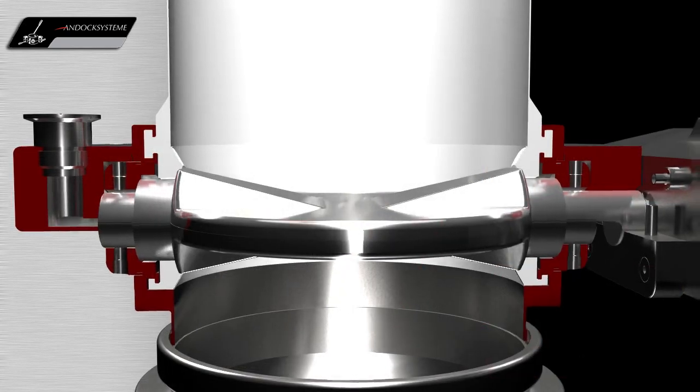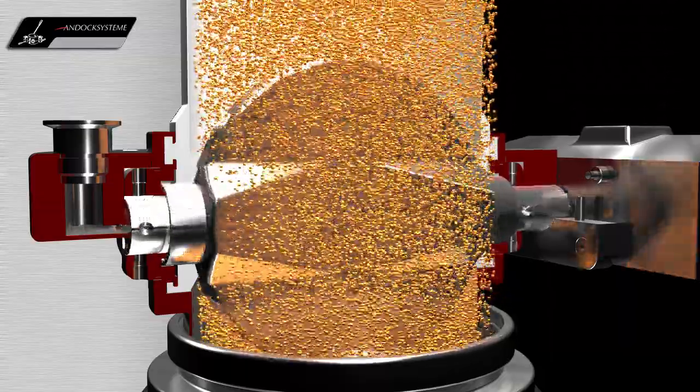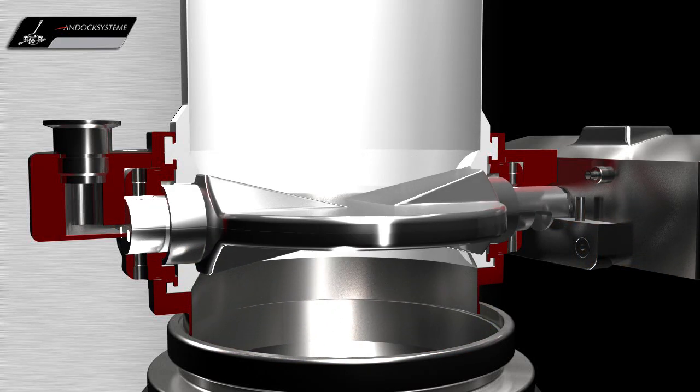Thus, the products are always charged or discharged under contained conditions. If required, it is also possible to achieve accurate weighing in the docked position with a thin wall bellows.